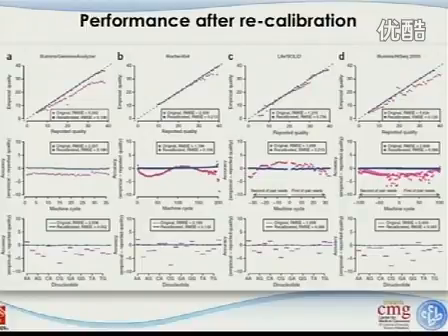All right. So if some people hand you their data and tell you they did the analysis, you want to ask them, did you recalibrate the base quality? And if they can't say what that is, that's a pretty good indication they didn't do it. You really want to understand what that is. And for the informatics students, you probably even need to know how to do it, all right? Because that's something people expect you to do.